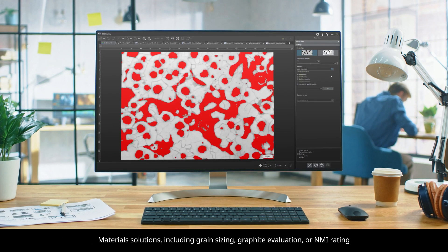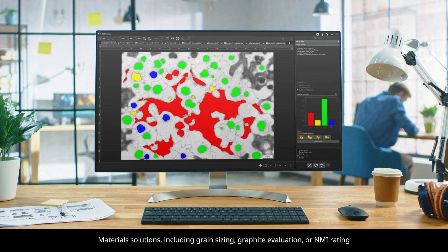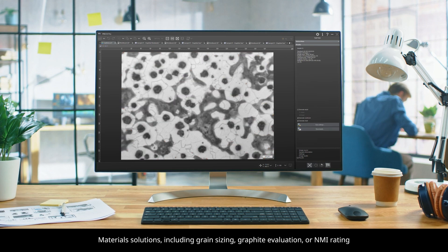With optional materials solutions, the software walks you through the steps required to acquire measurements that comply with the latest international standards.